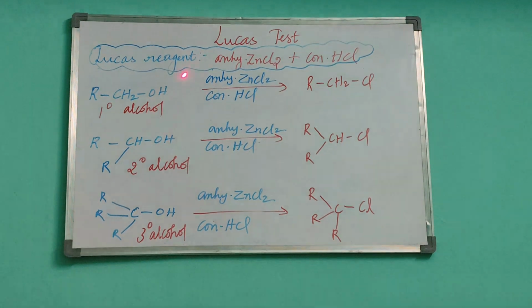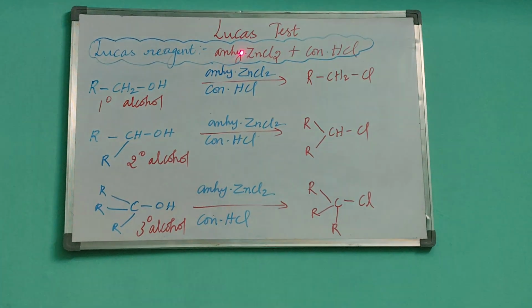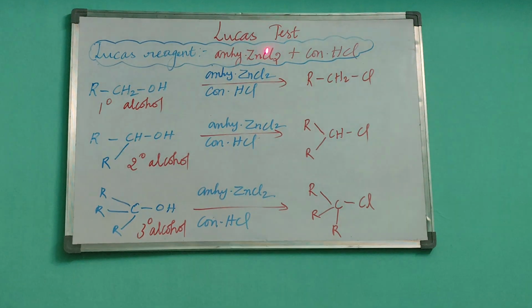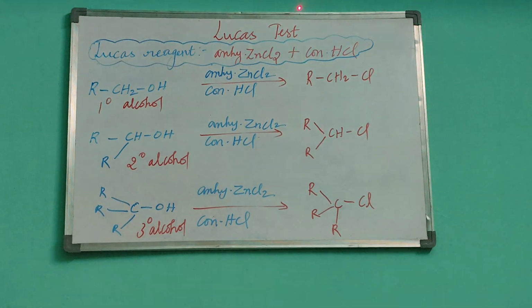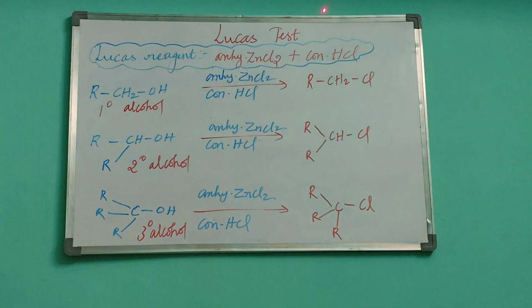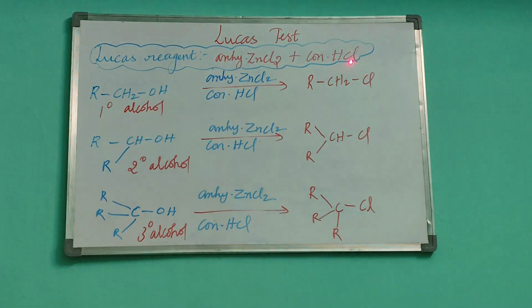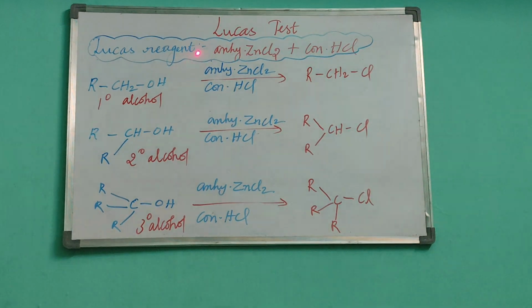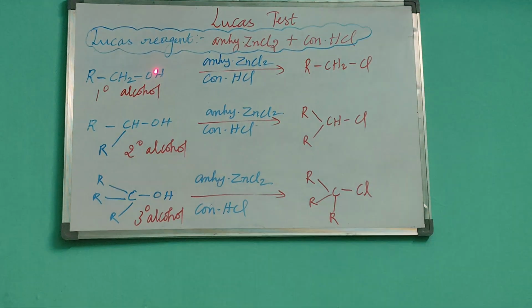Everyone, in this video we are going to discuss the Lucas test. Before getting into the Lucas test, you have to know what the function of this test is. Using this Lucas test, you are able to distinguish between the primary, secondary and tertiary alcohol given in the lab. So before getting into that, you may need to know what Lucas reagent is.